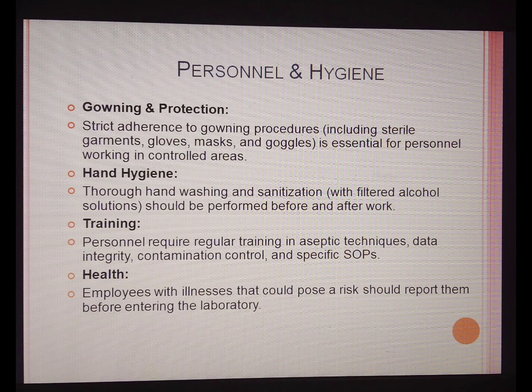Personnel and hygiene. Gowning and protection. Strict adherence to gowning procedures, including sterile garments, gloves, masks, and goggles, is essential for personnel working in controlled areas. Hand hygiene. Thorough hand washing and sanitization with a filtered alcohol solution should be performed before and after activity.